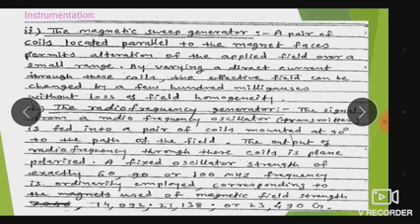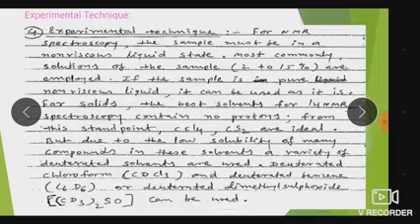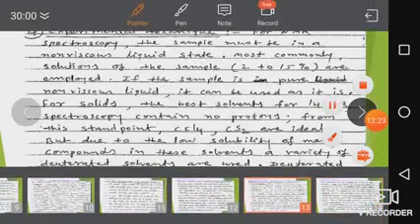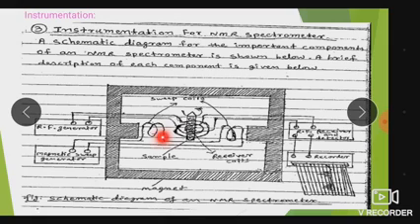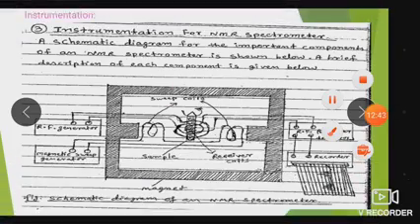Such a coil you have seen in the instrument. See, parallel coils are there, the magnetic sweep generators. Sweep coils are used for this purpose.